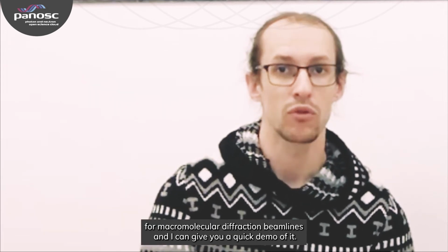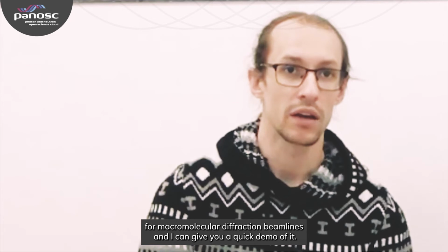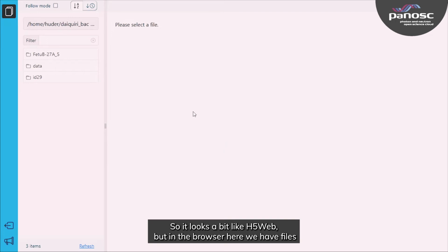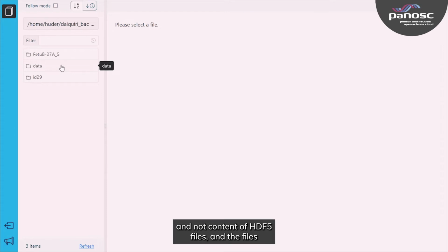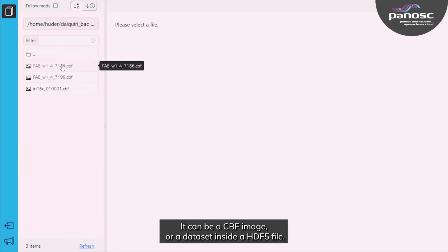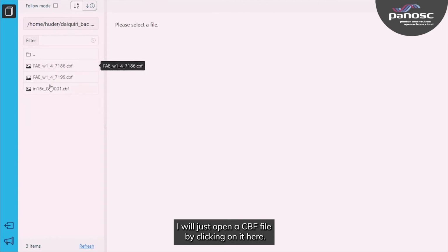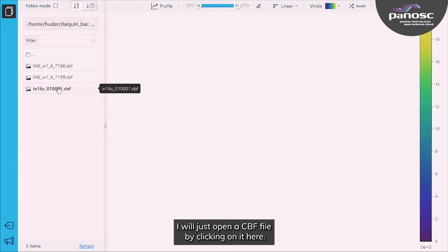Braggy is now in production at ESRF for macromolecular diffraction beamlines, and I can give you a quick demo of it. So here is the Braggy interface. It looks a bit like H5Web, but in the browser here we have files and not the content of an HDF5 file. And the files that we can look through in Braggy can be any kind of files. It can be a CBF image or a dataset inside an HDF5 file. I will just open a CBF file by clicking on it here.